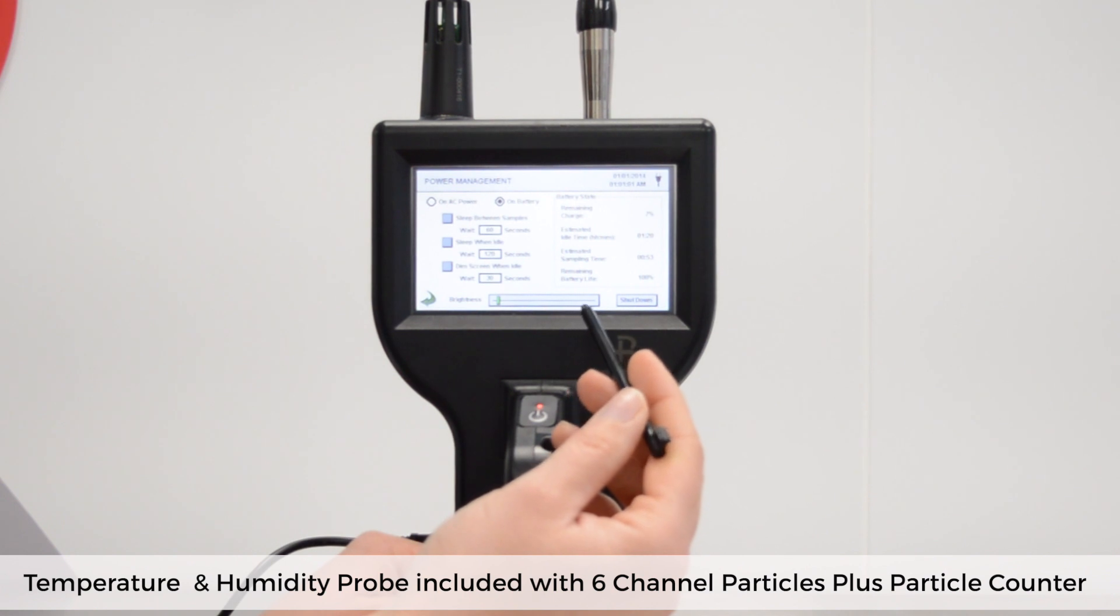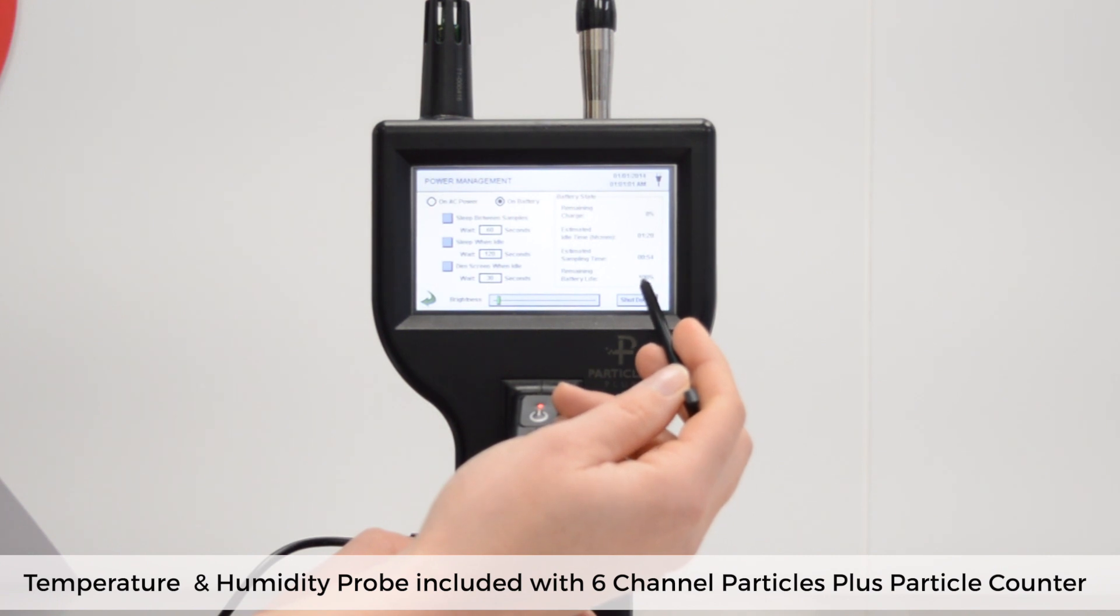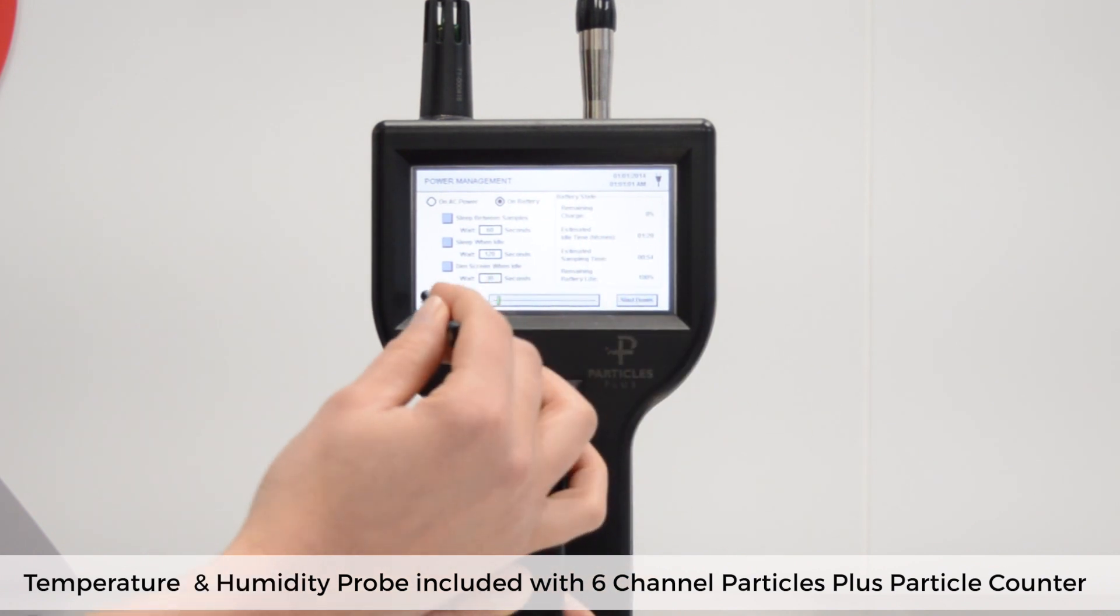The unit indicates the estimated battery time remaining and these figures will vary depending on the settings you selected, so you can see the impact of how much power you will save. This is really useful to check if the settings you selected are appropriate for the amount of testing you need to do. Let's tap back to go to the home screen.